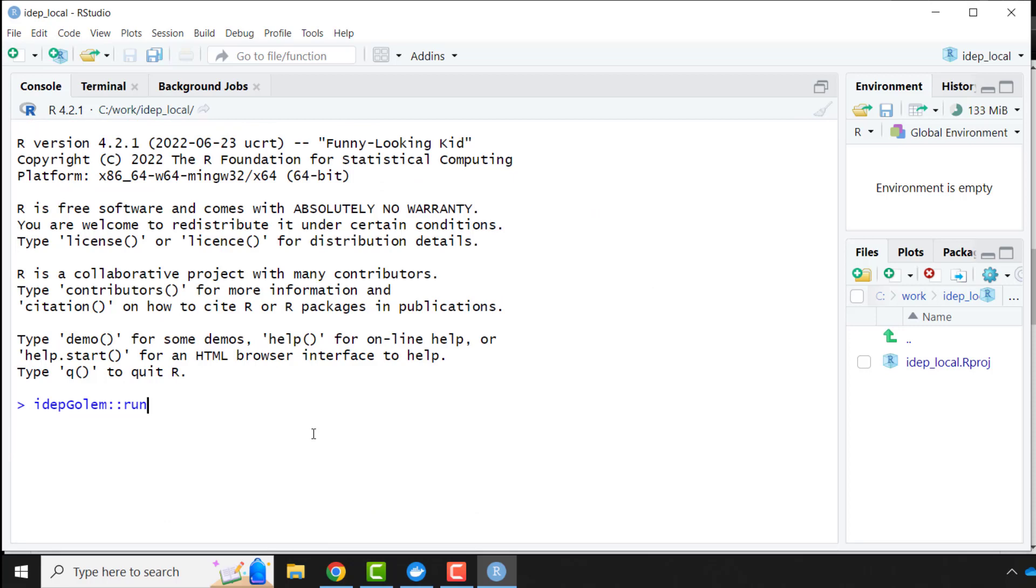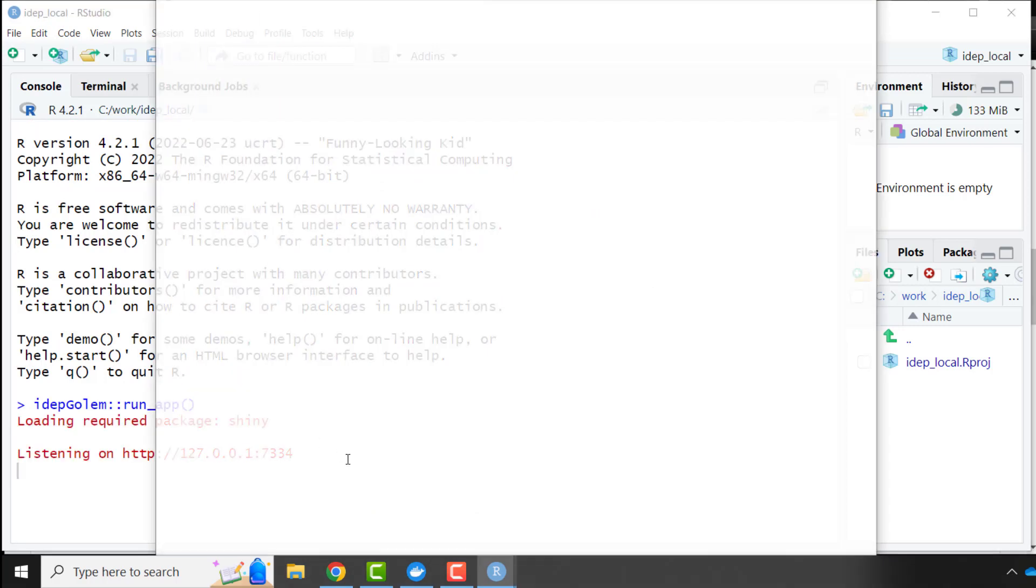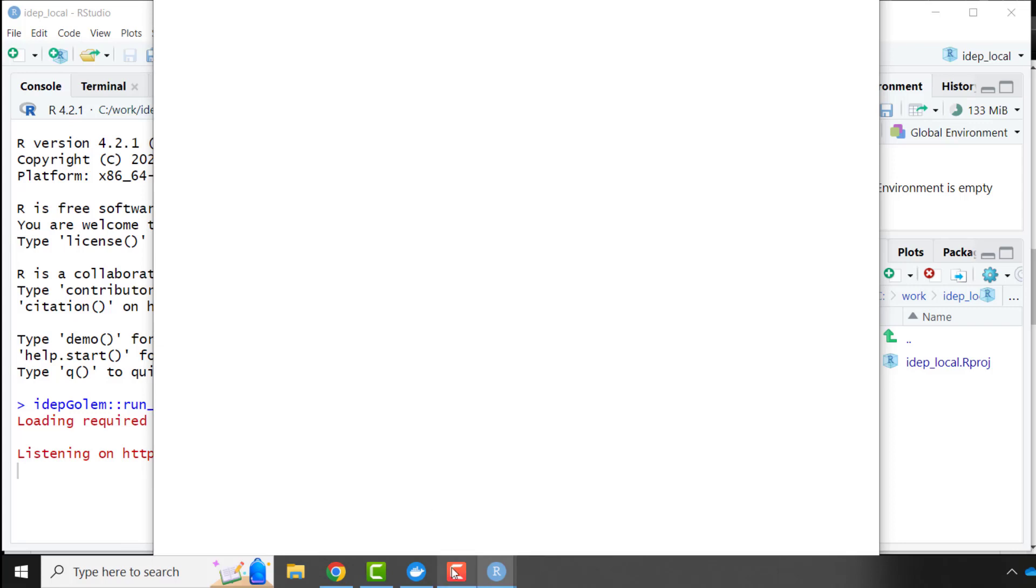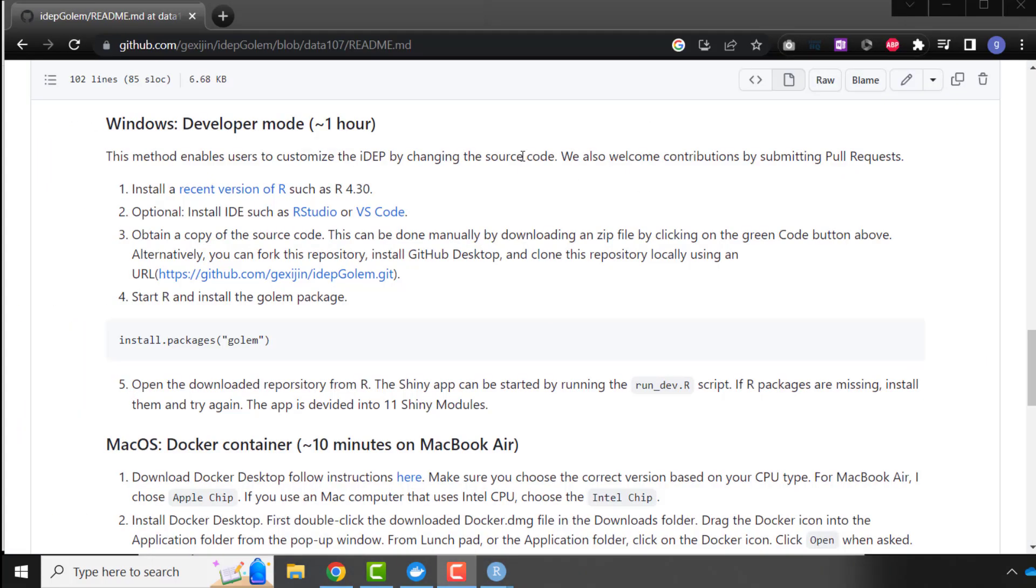Run app. And to do this, we'll start ADAPT.